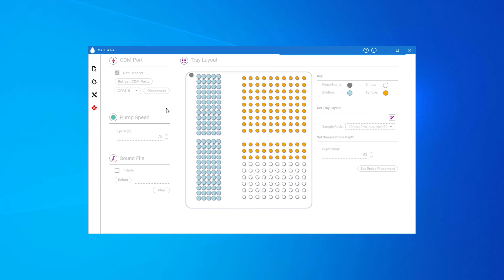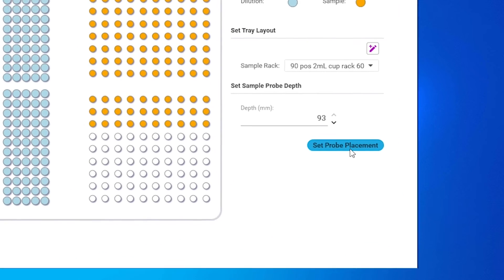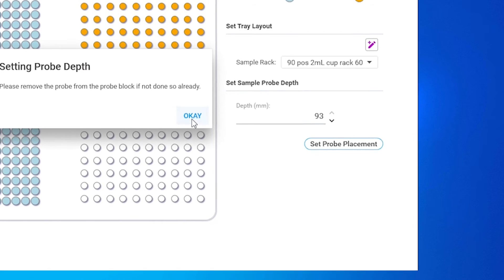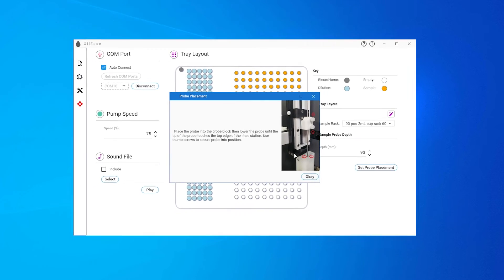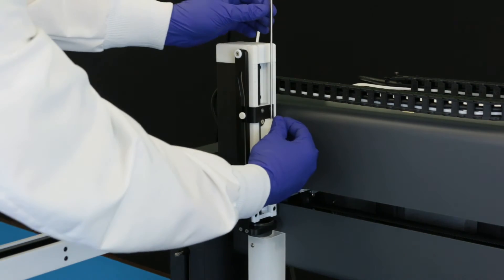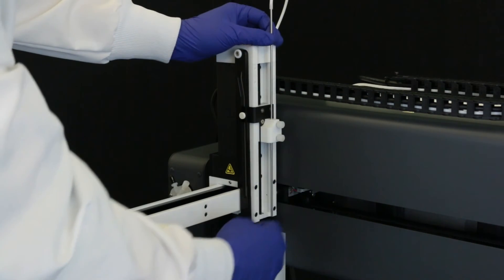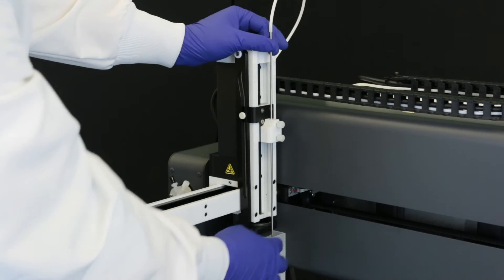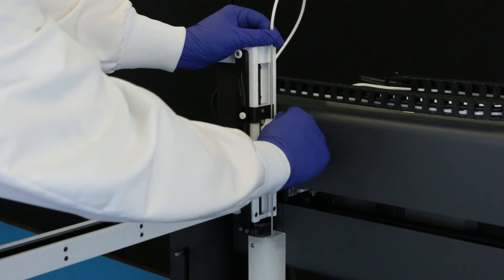On the configuration screen, click Set Probe Placement. The probe will move over the rinse station. Loosen the thumb screws and move the probe so that it just touches the top of the rinse station. Now tighten the thumb screws.